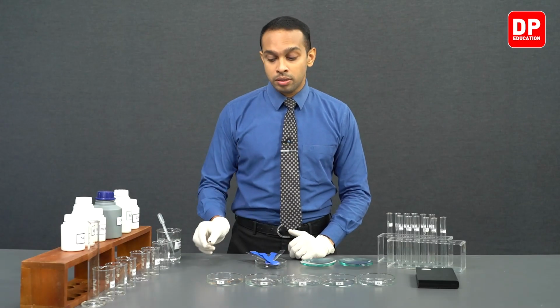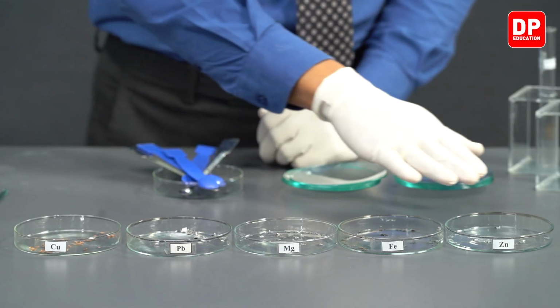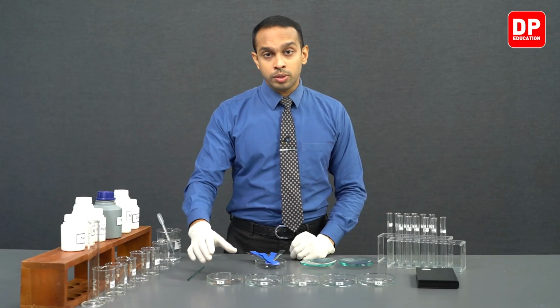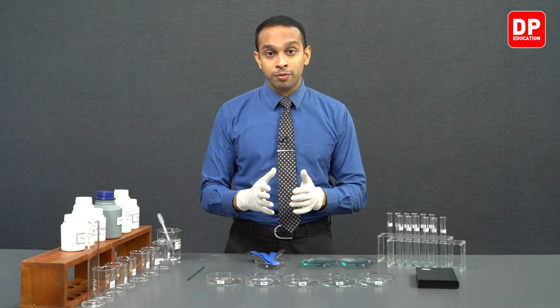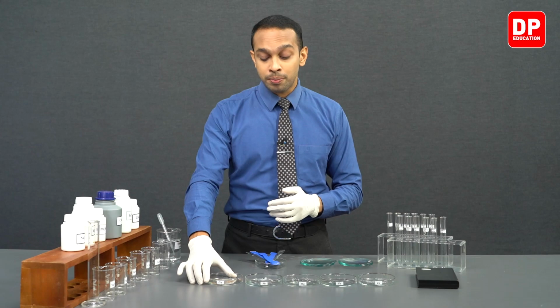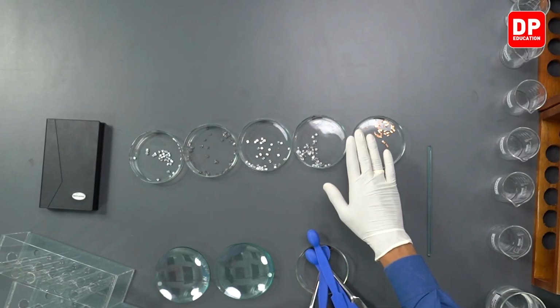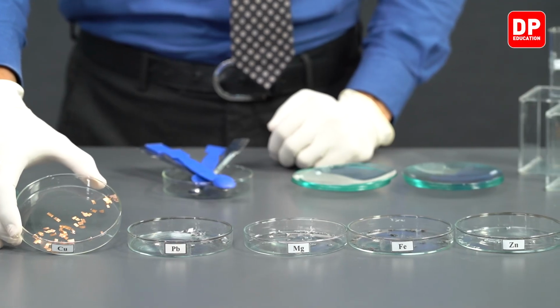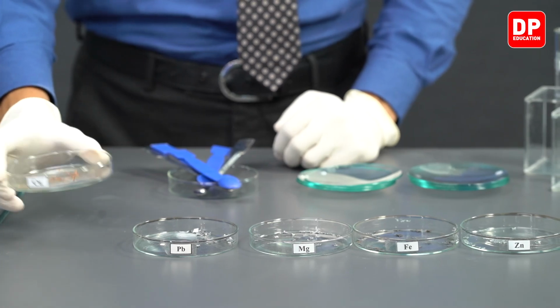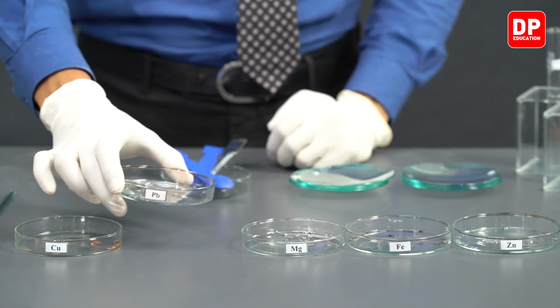Apart from those chemicals and the equipment I just mentioned, we will be using the metals that we have here as well. We'll be observing how different metals are capable of displacing different metal ions. So we will be needing pieces of metals in this reaction. We have 5 different metals here. We have copper. You can observe the color of copper. And then we have lead. We have small cut pieces of lead here.